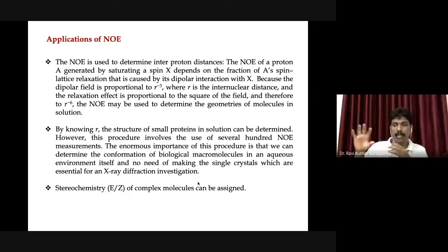But in the solid phase, the molecular structure has limitations. Certain molecular motions are frozen. Therefore, that molecular structure is correct only in the solid, and you can't take it and apply it to dock with some drug molecule and say whether this is suitable or not. That is not possible. But in the case of NMR, the beauty of this NMR technique is that it gives you the molecular structure information in the solution phase.